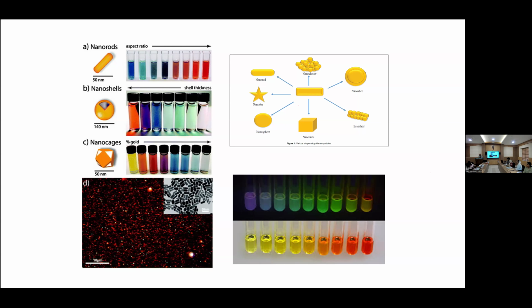Okay. So the doubt is, my sample is Ag doped ZnO in the ratio 1:10. In XRD, the characteristic peaks were present, but in the SEM EDS, zinc was absent. So what may be the reason? The reason may be because in XRD, we are analyzing the bulk sample. In TEM and SEM, we are analyzing a very small sample. If it is a well dispersed or very good sample, then maybe in the analyzed region, there may be no particles of the zinc. That may be the possible reason.